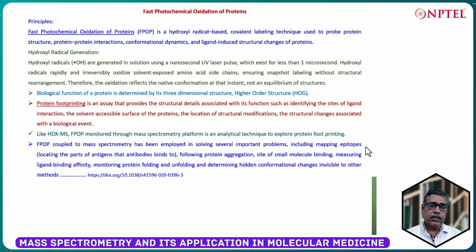Now, the hydroxyl radicals, whatever is produced, are very reactive. So, they rapidly and irreversibly oxidize solvent exposed amino acid side chains, ensuring snapshot labeling without structural rearrangement. Therefore, this hydroxyl radical based oxidation reflects the native conformation at that instant, not the equilibrium structure. So, basically structural changes along with kinetics, along with time frame, we can monitor using this strategic approach.